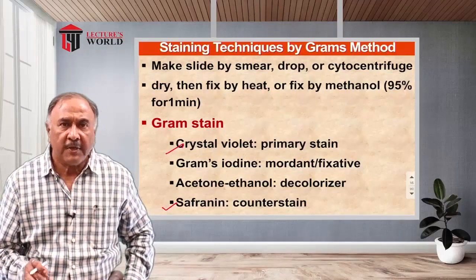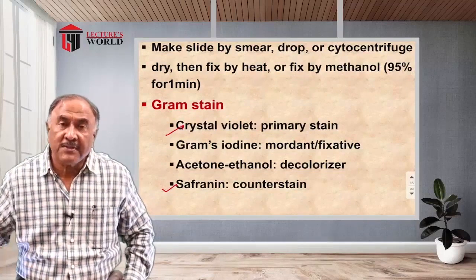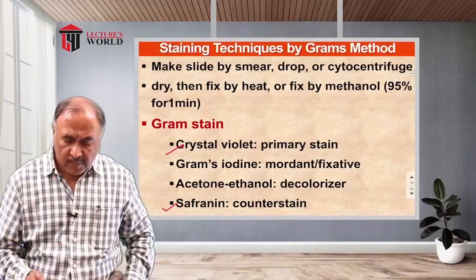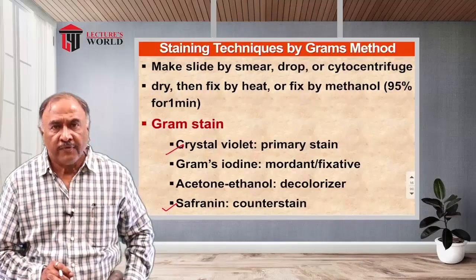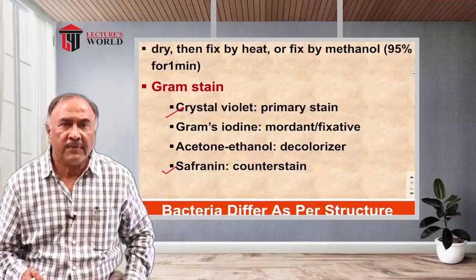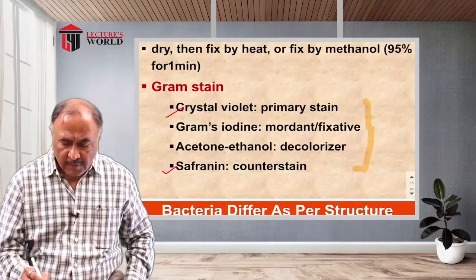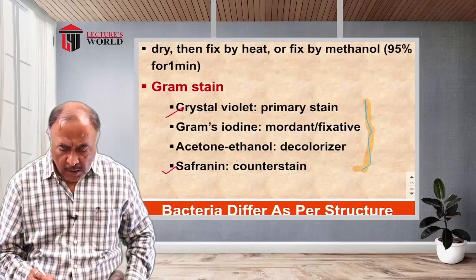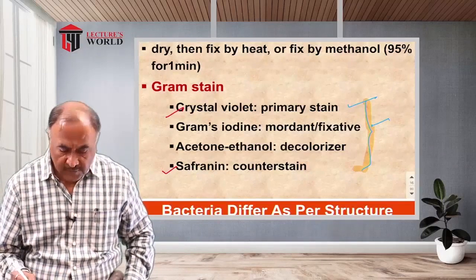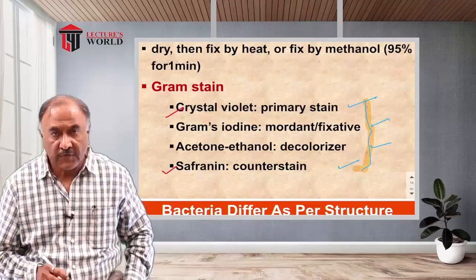This preliminary identification also helps us select which kind of media we will use in the second part of the procedure, cultivating the organisms.